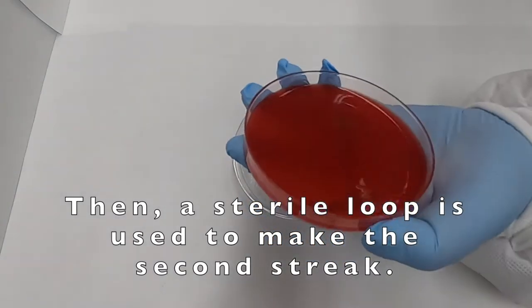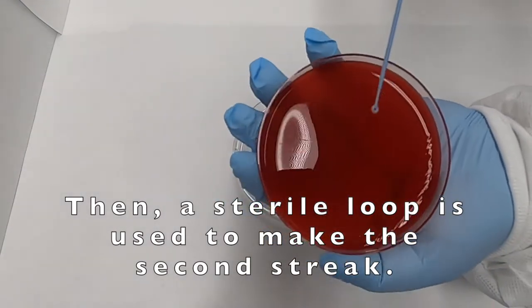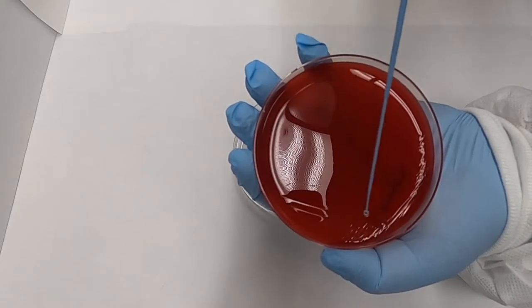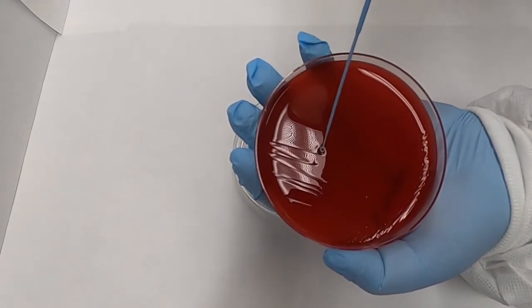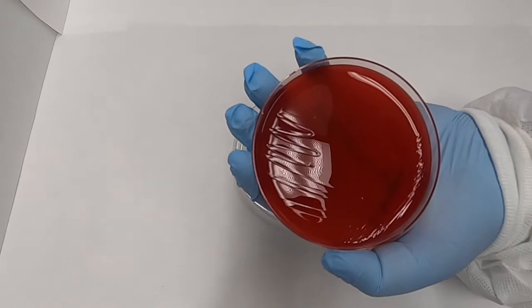We then use a new loop to make our secondary streak. We start by going back and forth across the agar surface two to three times into our primary streak and then extending outwards.